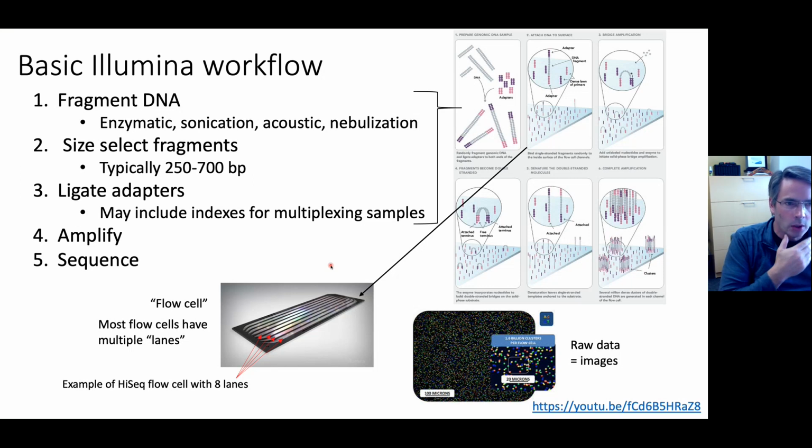So, basic Illumina workflow: you extract your DNA from your organism, fragment that. There are multiple ways to fragment: enzymes, sonication, nebulization. Basically, you're just shattering the genome into lots of small fragments.